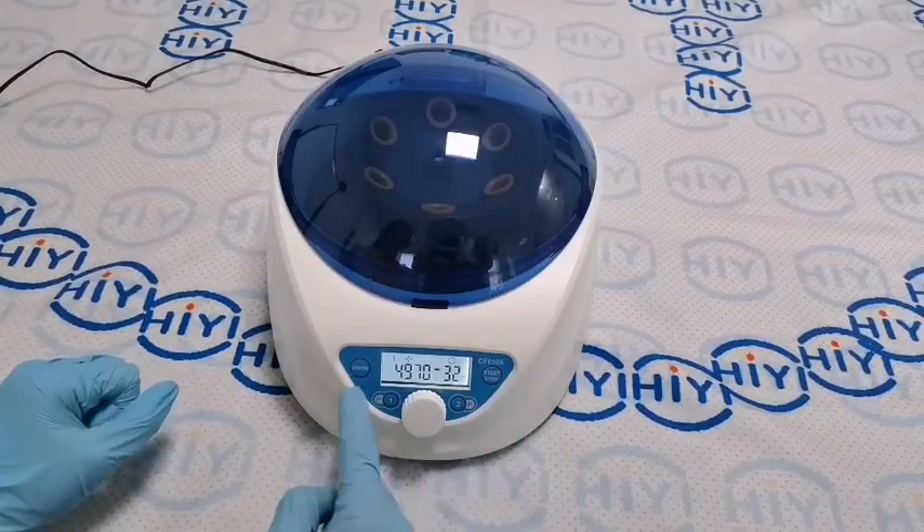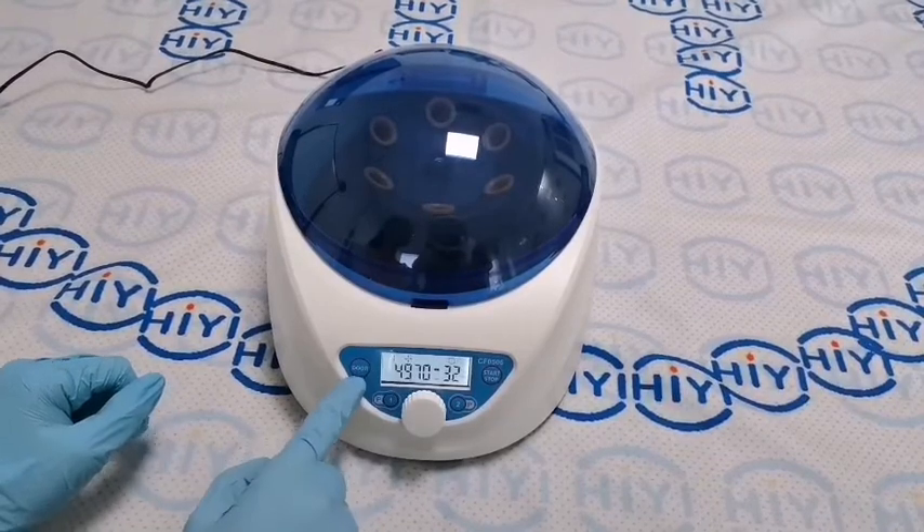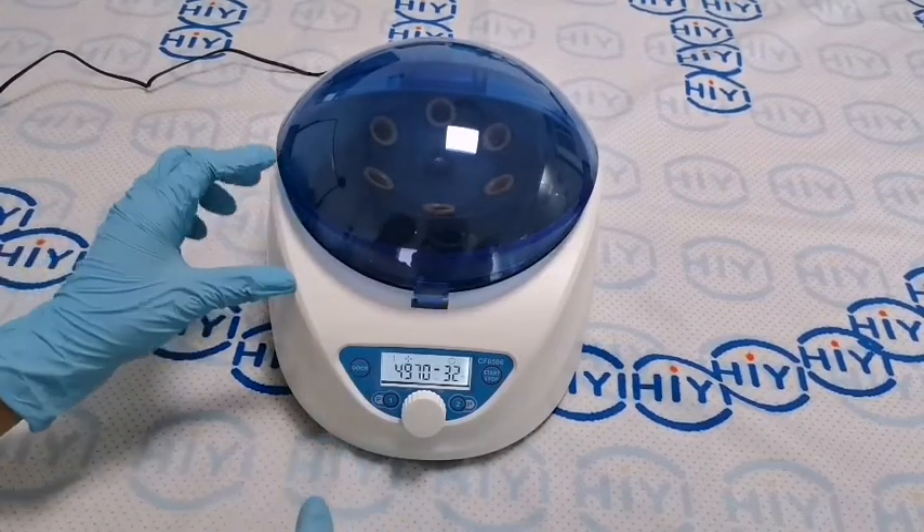Look at the panel. We can look at the LCD display. This is the door button. Press it — the door is open.